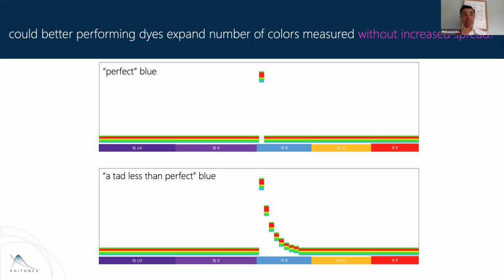So that's something that we've done on 2 of our blue dyes, and now we're actually building out quite a bit more dynamic range, particularly as of this past week. So we've got some new results where you can do several, possibly even orders of magnitude of dynamic range, right? And so go much, much lower. But then, of course, similarly on the other end of it, if you've got something like CD44 or 45, tune that down so that signal intensity also doesn't lead to spread in the panel.